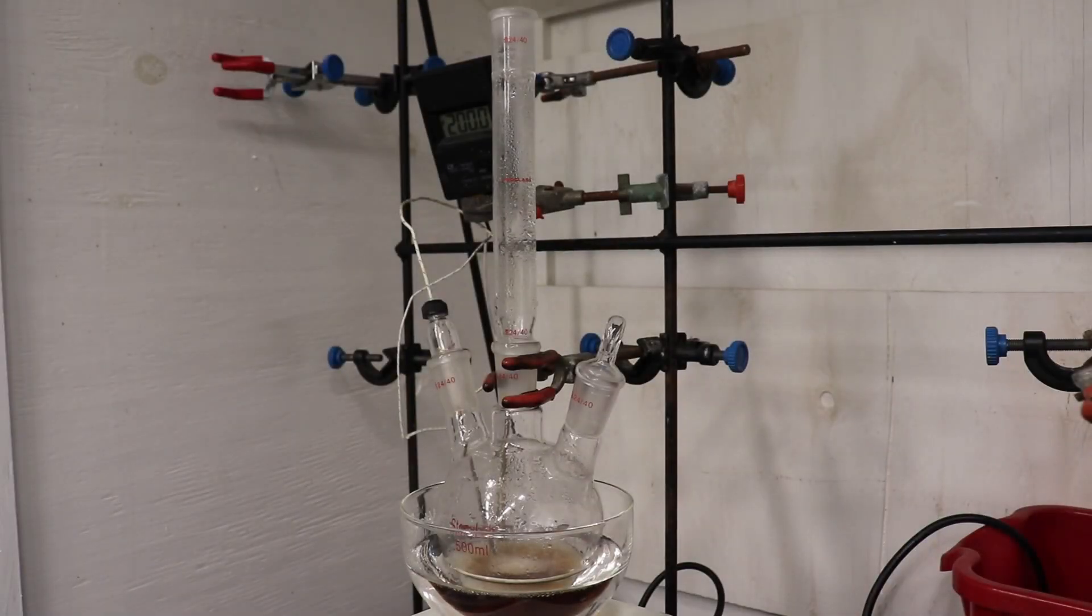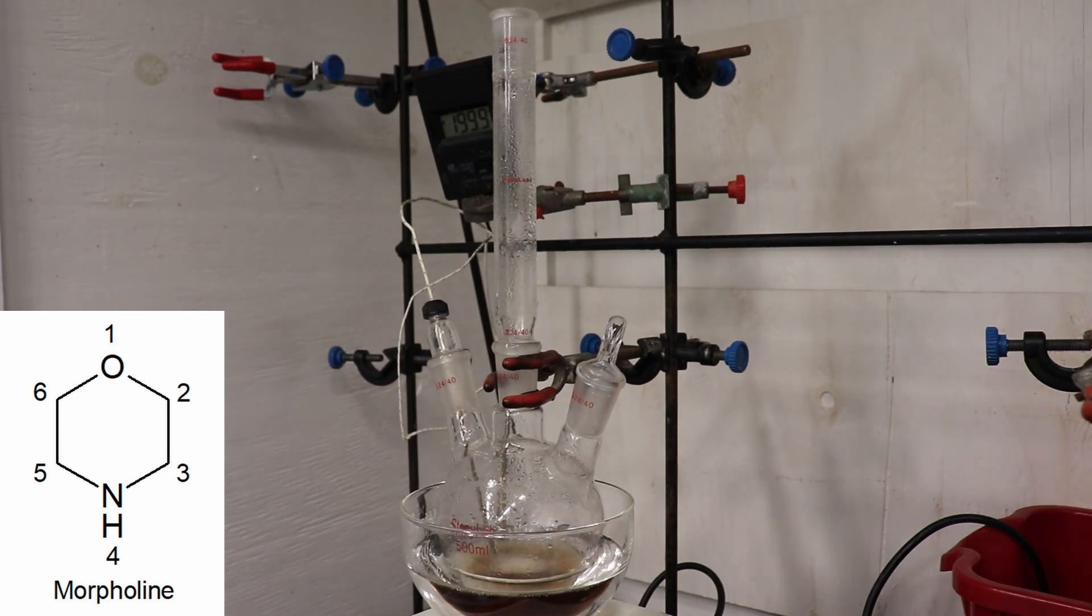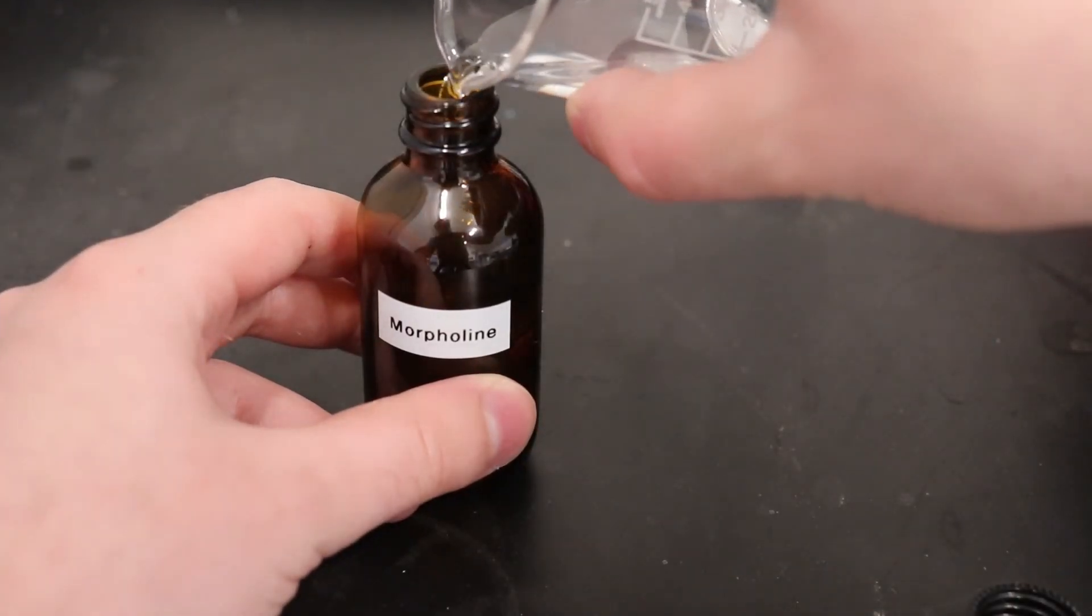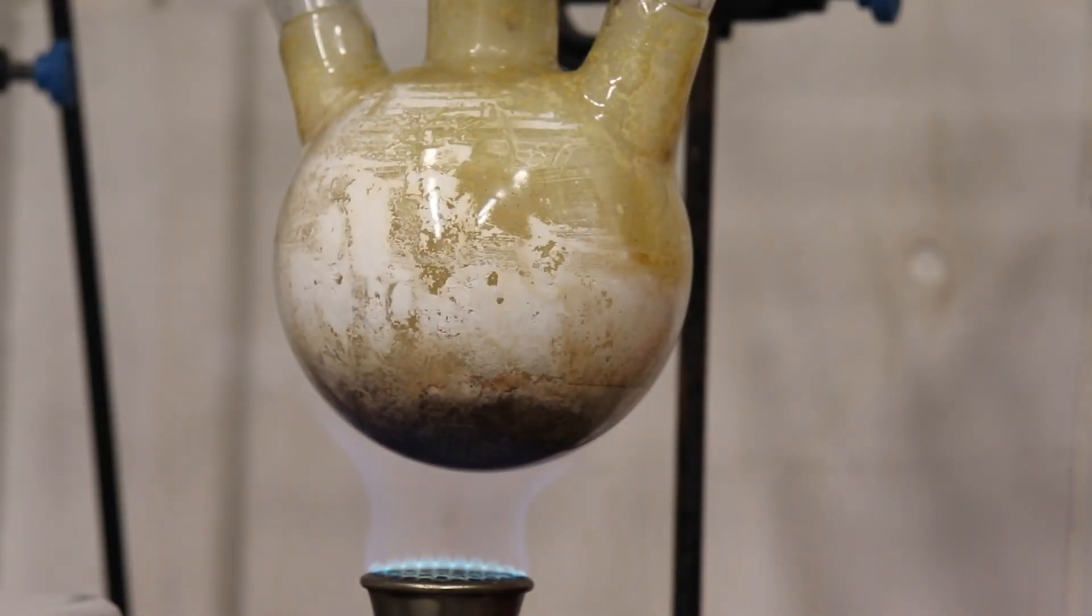Today I will be demonstrating the synthesis of morpholine from diethanolamine. Morpholine is a heterocyclic secondary amine with a wide range of applications, but is most commonly used in the formation of enamines and as a general building block in organic chemistry.